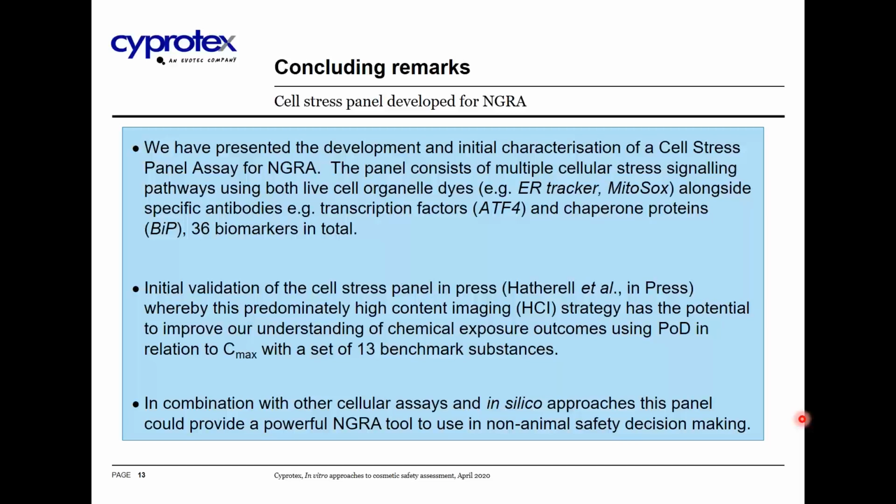And some initial validation, in which we've used 13 different benchmark substances, with the establishment of the point of departure and how we've been using that to normalize against Cmax as an IVIVE approach in risk assessment, and as I said, as part of an NGRA tool.